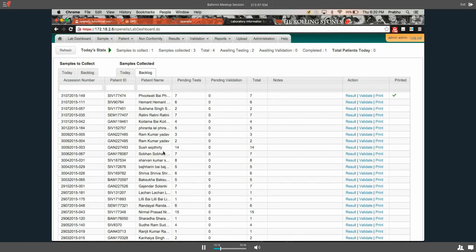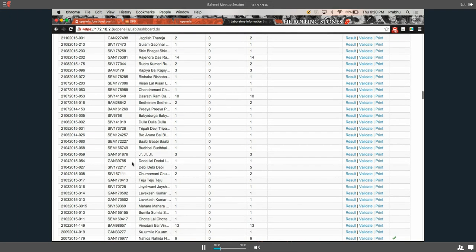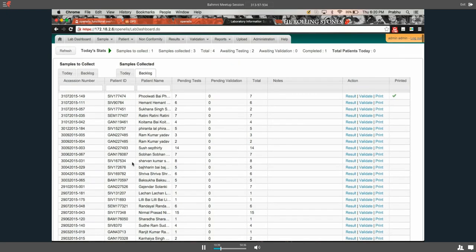I think the question got answered. So, yeah, it's clear. Basically, everything other than the samples that are collected today, as soon as the date changes from today, the sample would start showing up in backlog, and the backlog currently shows all the samples that have been collected so far.